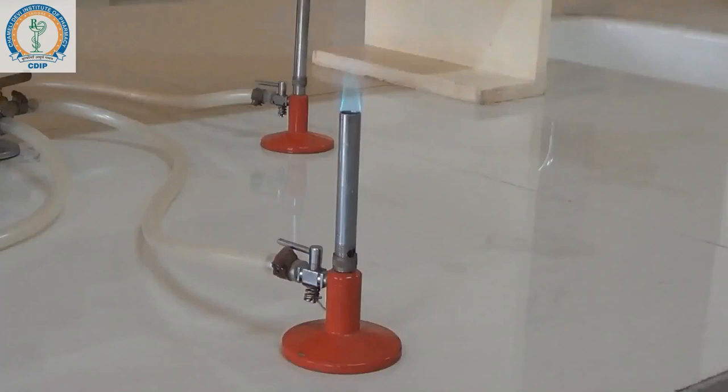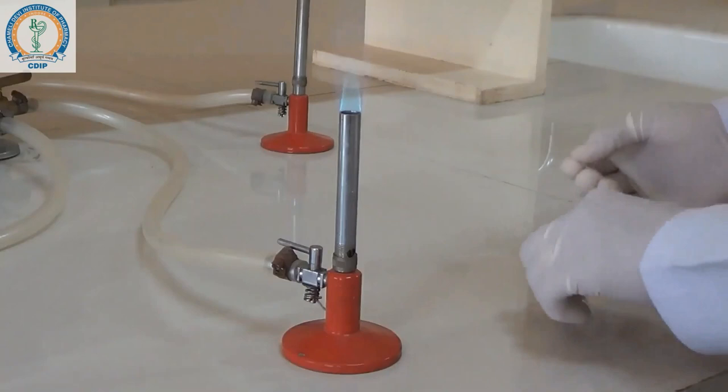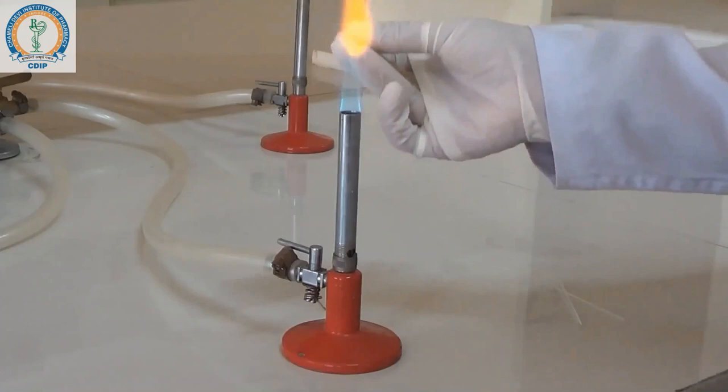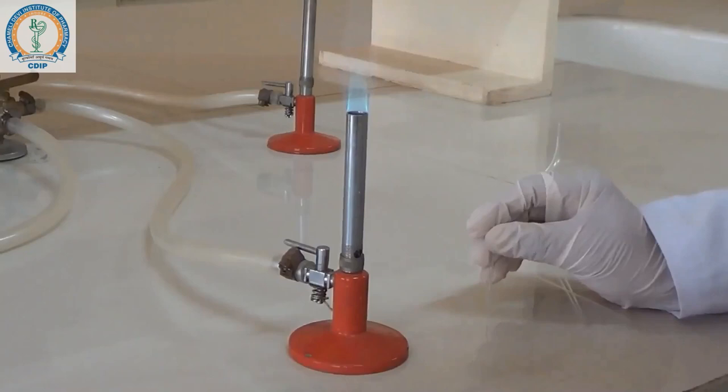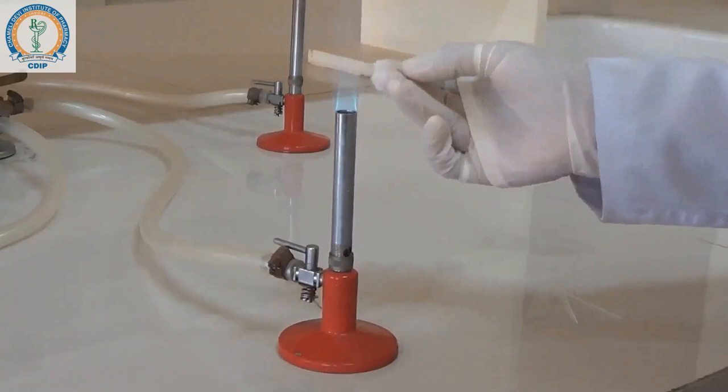The first step is sealing these capillary tubes. For sealing, we take the capillary tubes inside the flame like this, rotating in this manner, then putting the end on the platform so that it will close easily, and tapping it here.